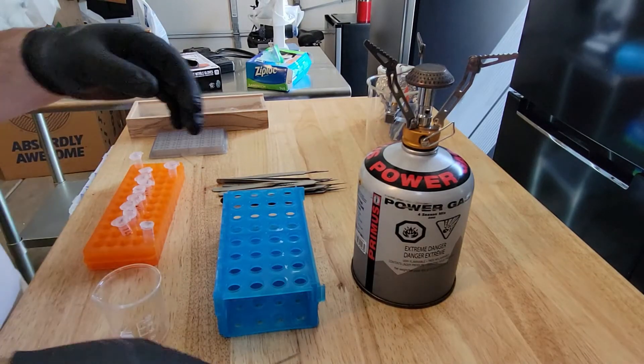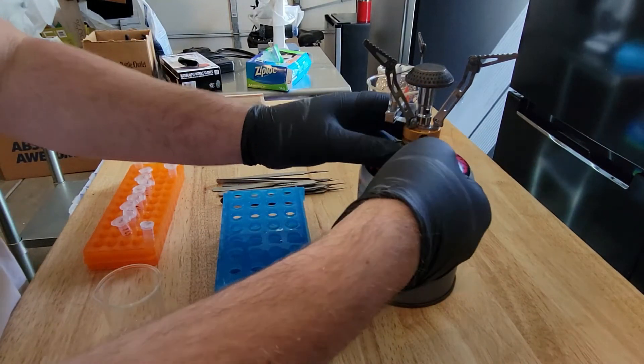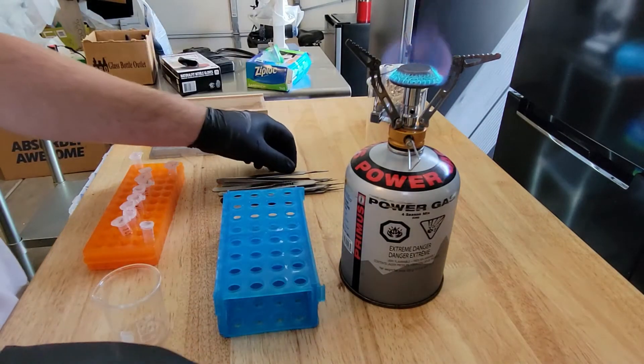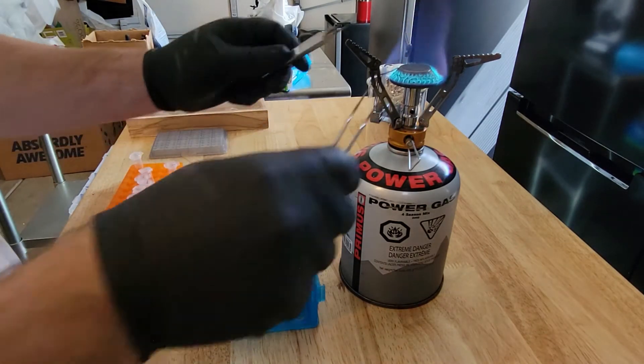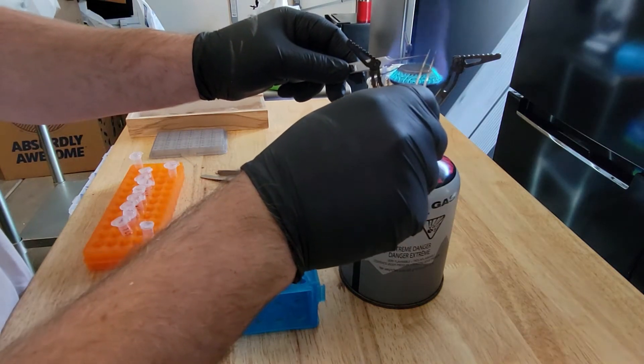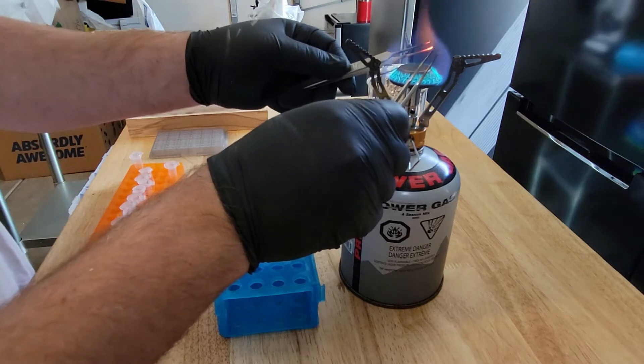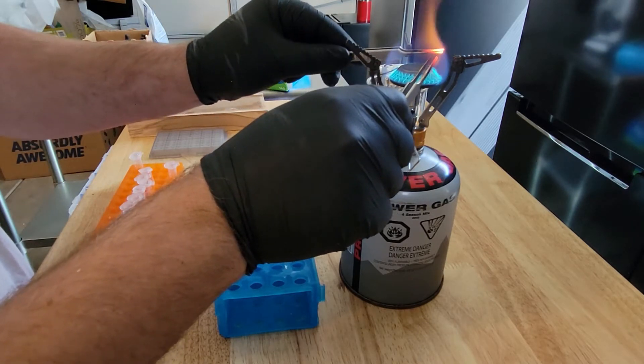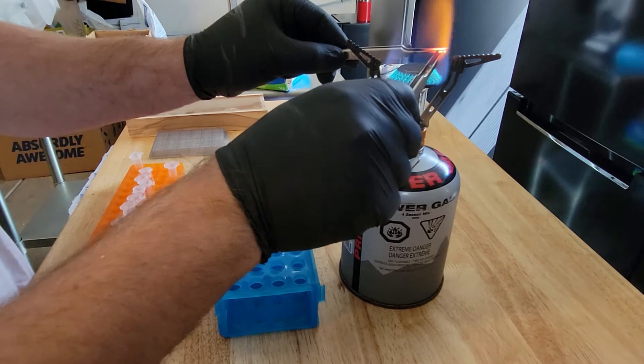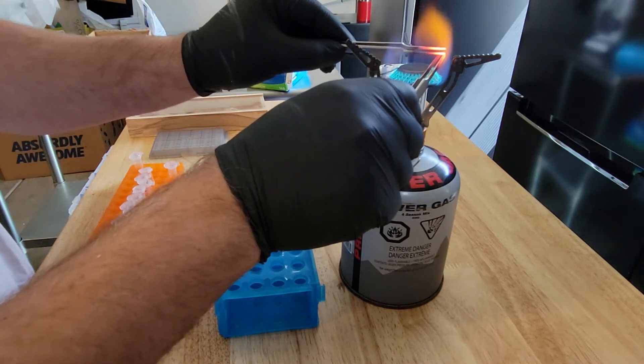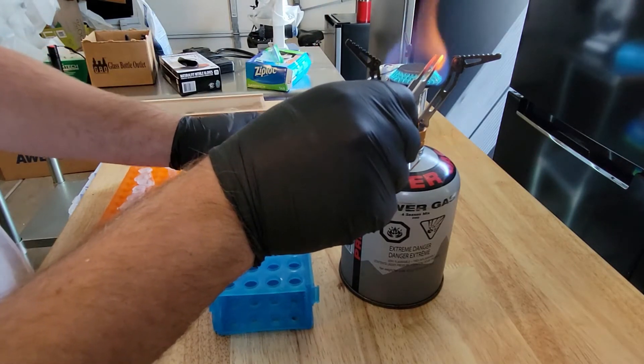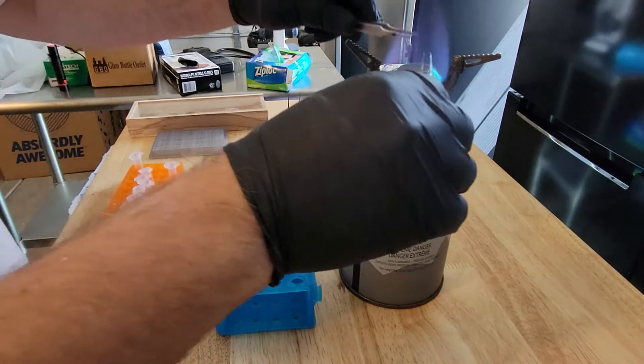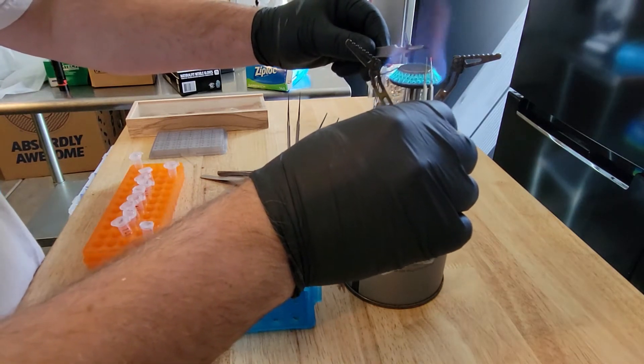The next step is we're going to decontaminate our tweezers. I'm going to use this simple camp stove, which I got for like $20. I'm going to burn these tweezers. This is less to sanitize them and more to actually remove any DNA residue. Once you get them red hot, you know that you've destroyed any DNA that's on there. I'll carefully place them in this little holder. I'm going to be extremely careful not to touch them. They're going to stay hot for a long time.